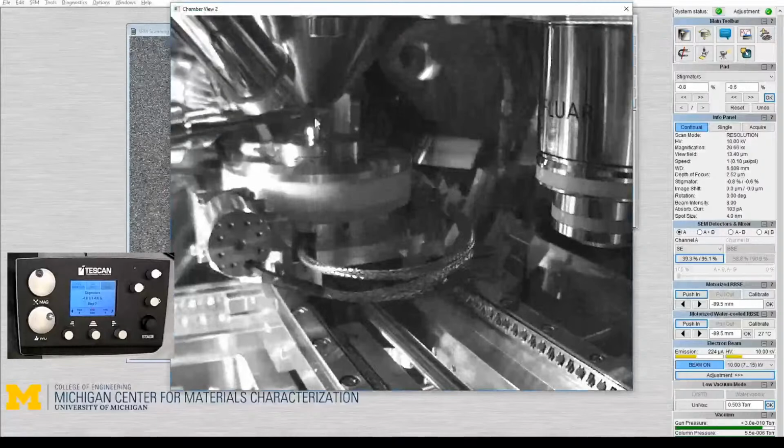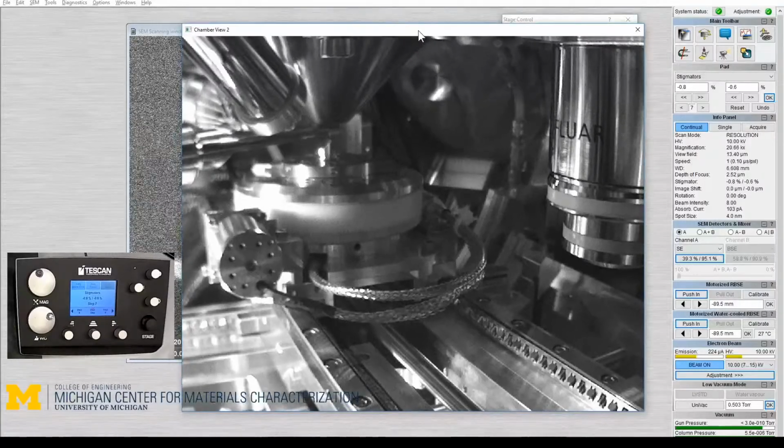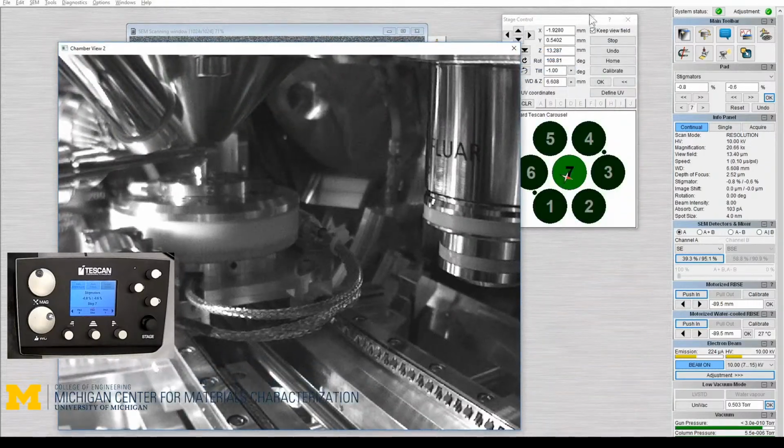I'm going to make the window much larger and retract. Nope, sorry. I'm going to do what I told you guys to do, which is drop the sample first. So let's go straight down.